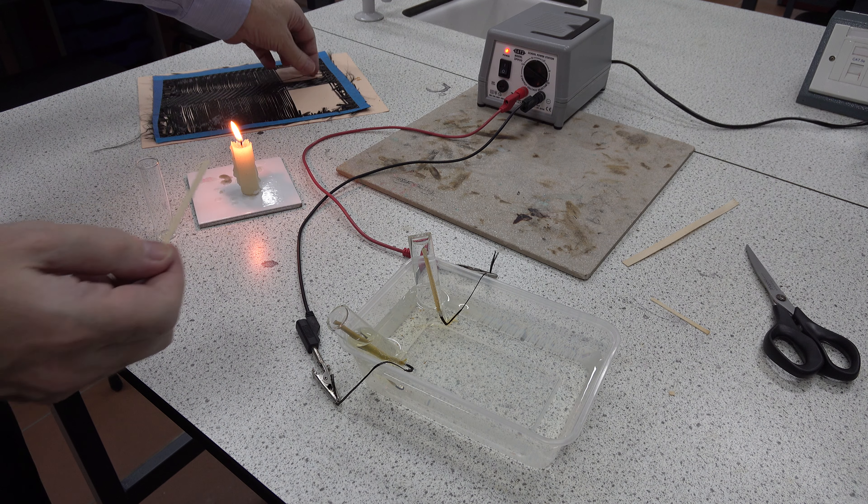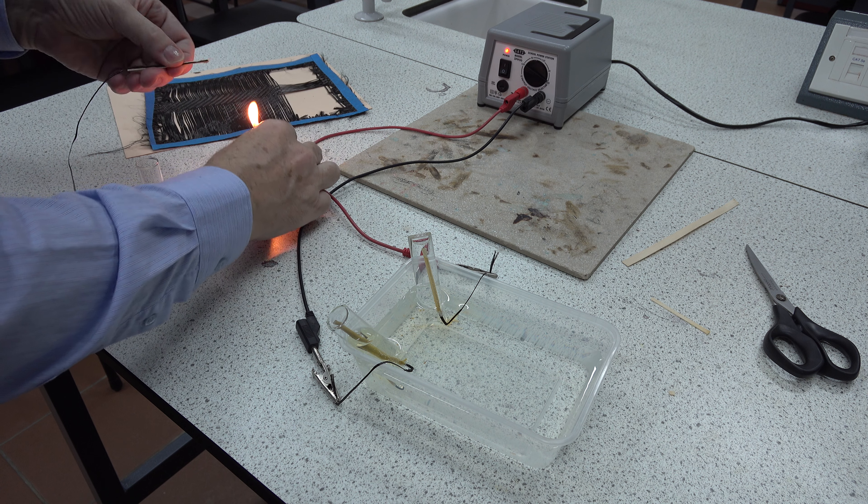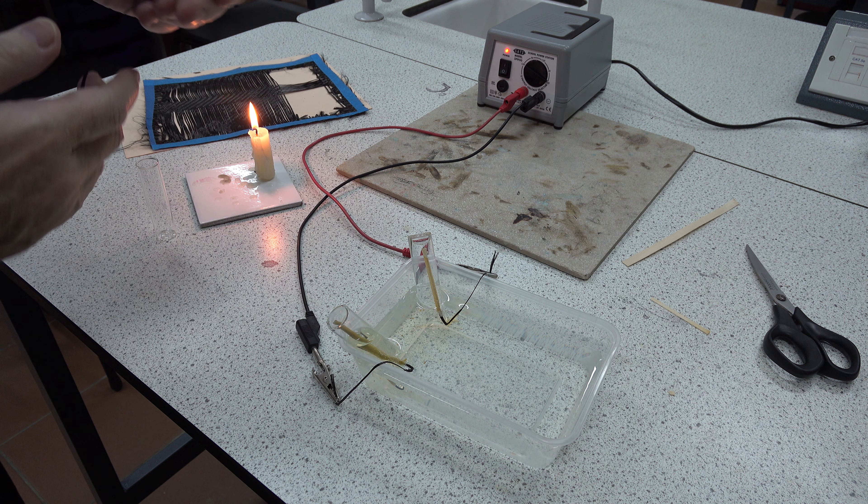Here's part of a wooden splint that has been cut to the length of the tube. If we take the splint and a length of carbon fiber, we can align the fiber with the splint like so, and then secure the fiber to the end of the splint with a little candle wax.